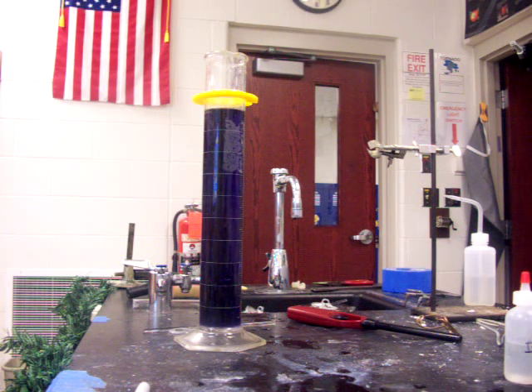Here we have a graduated cylinder filled with water and I've added to it a base, sodium hydroxide, and we've also added universal indicator solution. So we have a purple or blue color being given off by the base.